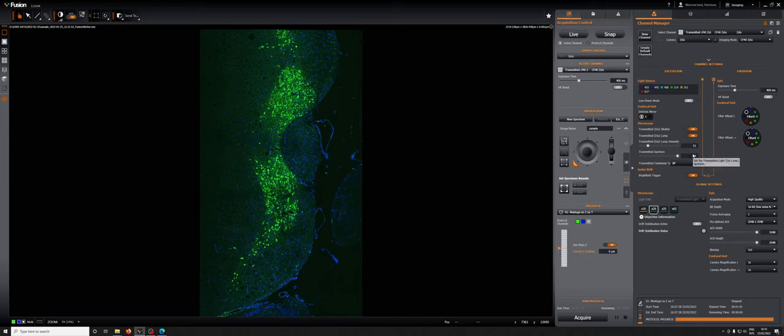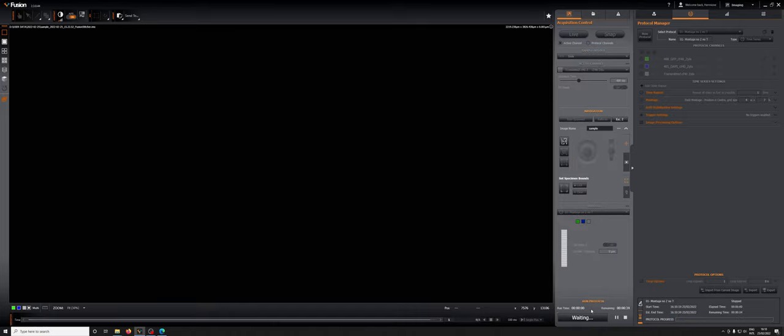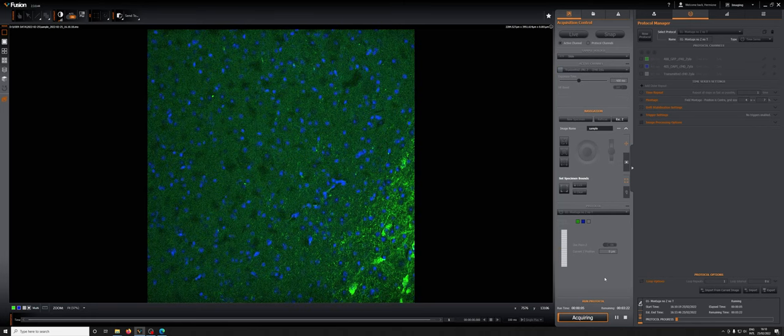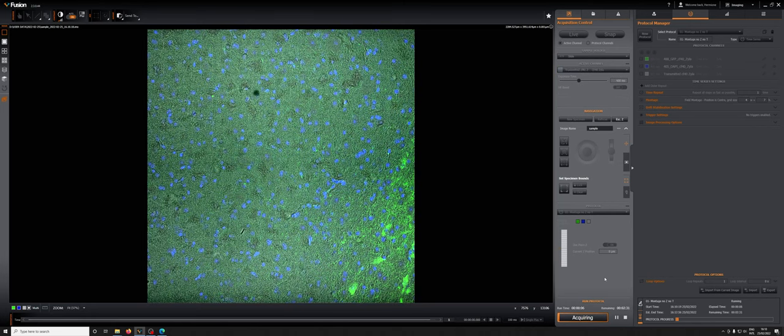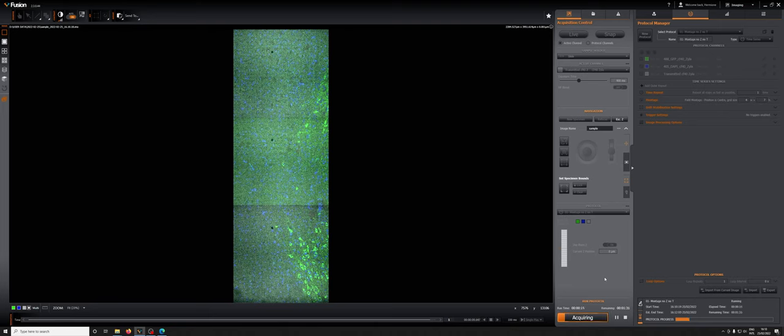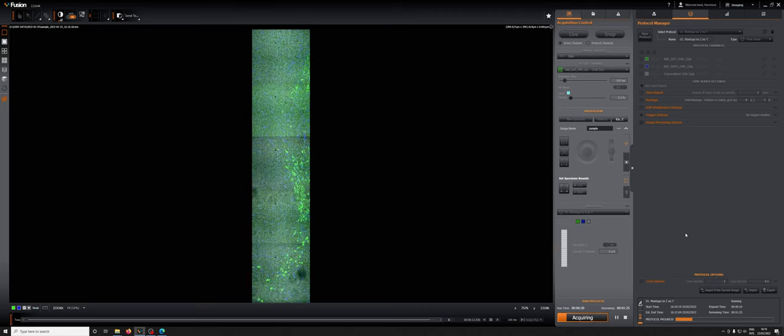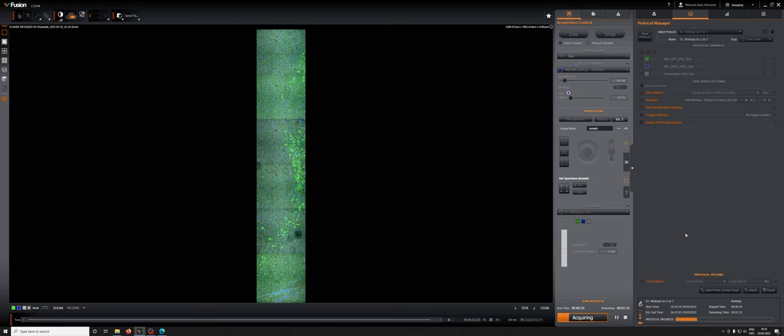In this case for example we have a montage protocol. If we acquire we will get images in all three channels. You can see that this is working as expected. That's how you add a transmitted light channel and combine it with fluorescence channels.